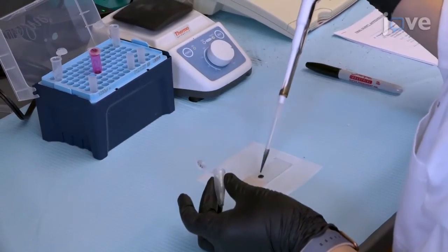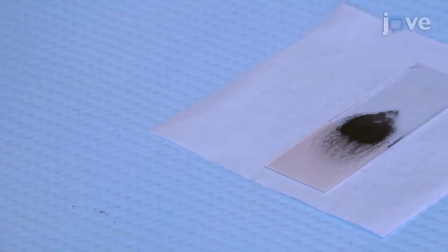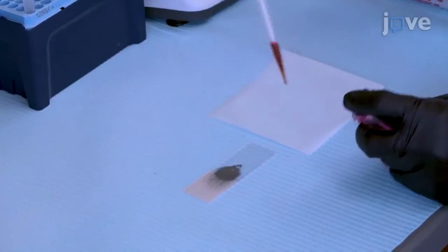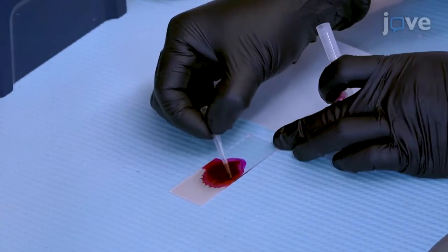Pipette 250 microliters of the tungsten bead suspension onto a glass slide. Wait for the suspension to air dry and add 300 microliters of the dye solution.